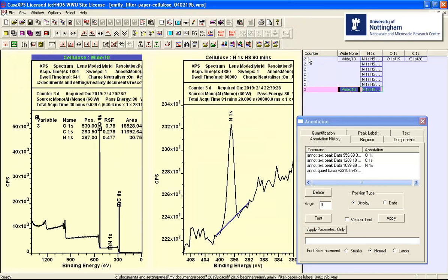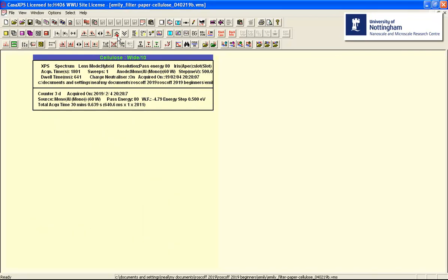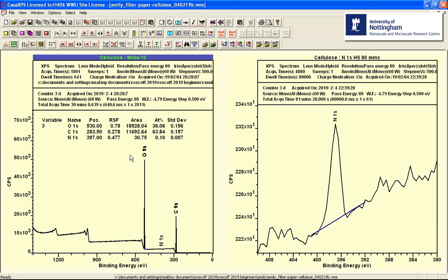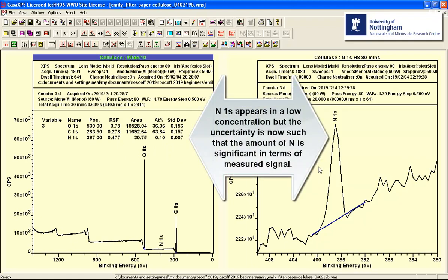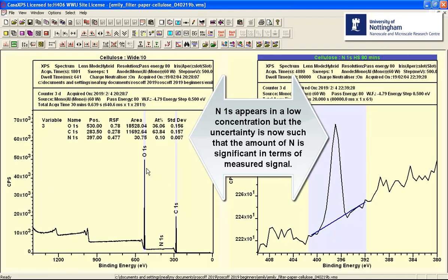And so now I have a quantification table that is being constructed from the nitrogen 1S on the nitrogen 80-minute VAMAS block. And it's being combined in a quantification that is giving similar sorts of results that we had for the survey alone. So this is the label that you see here that corresponds to this nitrogen, but there's no nitrogen region. Let me put regions on so you can see. No nitrogen region. And here we have the region that is used in the calculation over here.